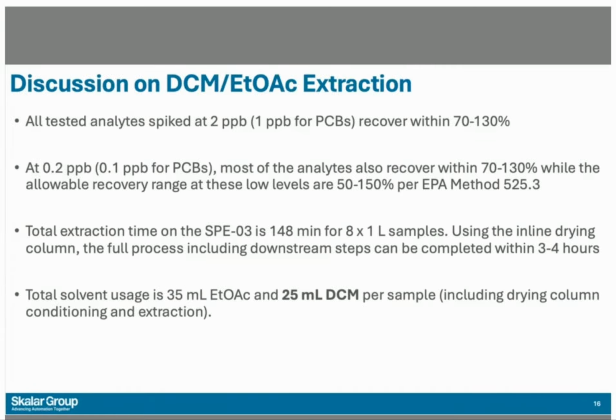So I was feeling pretty good about those numbers until I went to Johnny Mitchell and Julian's talks, where they were using, I think, about 4 milliliters of DCM per sample. So this is a great improvement over the 360 ml, but we can take it further. If liquid-liquid extraction can be hitting a fifth of that, then there's something else we should be able to do from the SPE side as well.